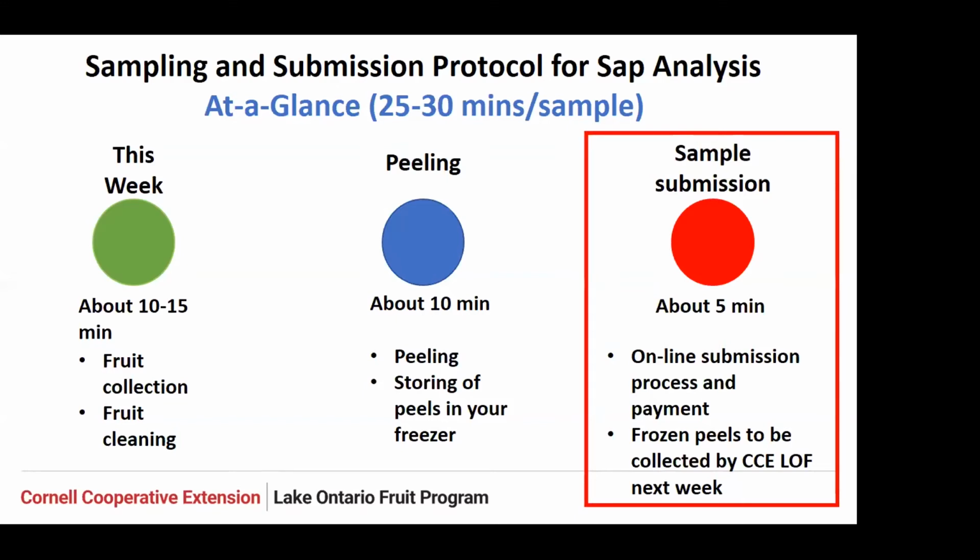We're doing it the old-fashioned way, just to control everything we're trying to do, so we can really give you the right results and we don't have any issue with any transfer of bad sample in the lab or anything. There are multiple steps, so please label your bags very well and see the video. And the video is on the Lake Ontario Fruit YouTube channel, correct?